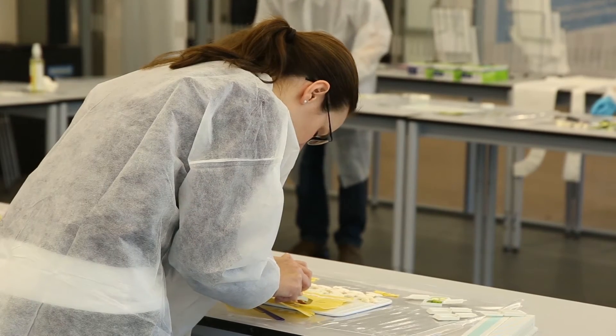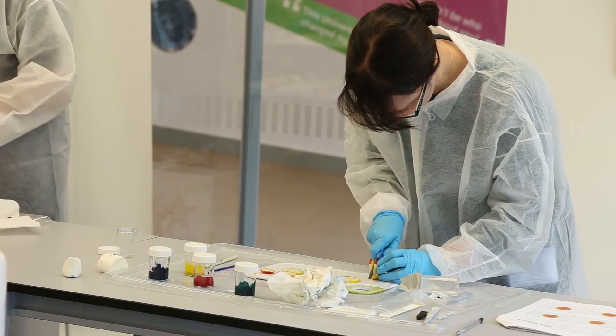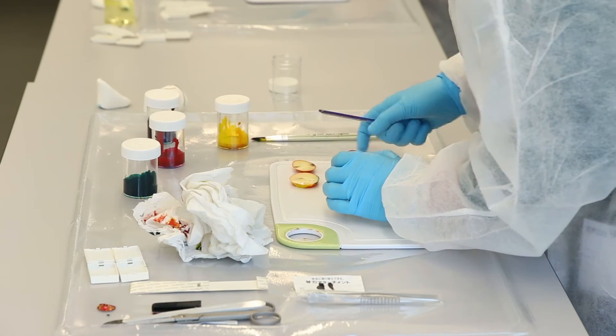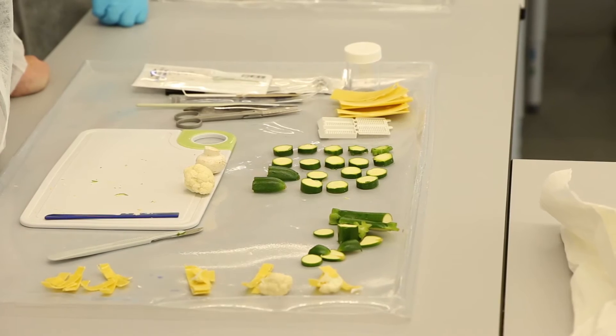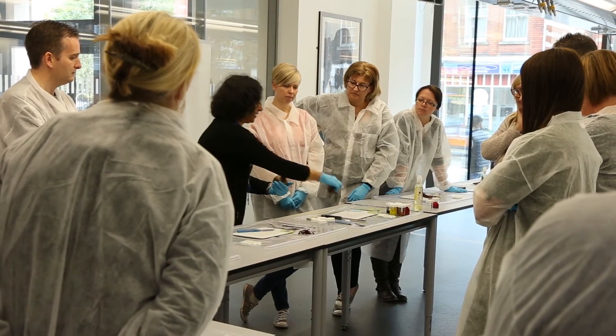As an STP — training to be a clinical scientist — I actually have to do a different version of the portfolio that requires me to dissect all various different types of tissue. This has allowed me to get that starting point, so I can now go into the next two years with an idea of what I need to do. I will eventually hope to do the dissection portfolio itself, so it's been useful as a stepping stone to the next point.